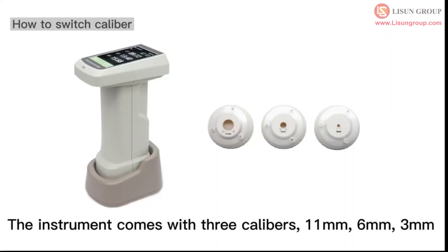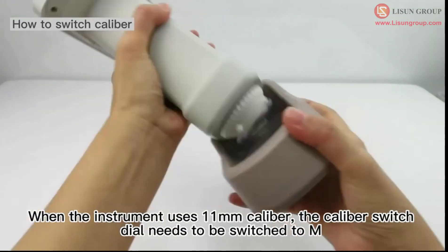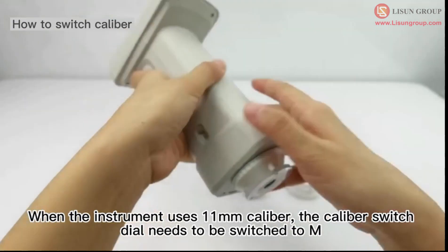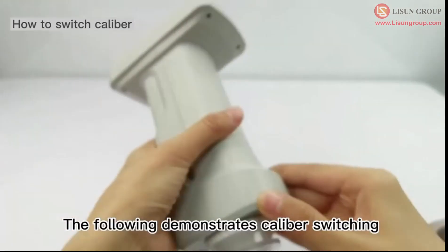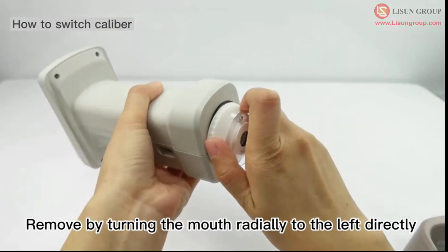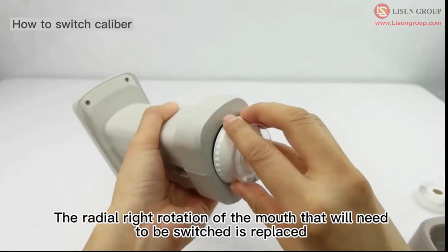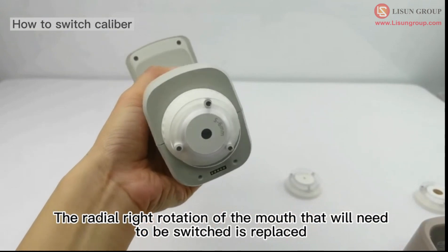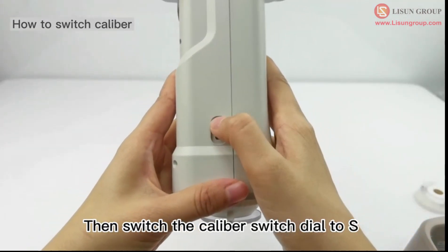The instrument comes with 3 calibers: 11 mm, 6 mm, and 3 mm. When the instrument uses the 11 mm caliber, the caliber switch dial needs to be switched to M. To switch calibers, remove the current one by turning the mouth radially to the left, then replace it by rotating the new one radially to the right. Switch the caliber switch dial to S.